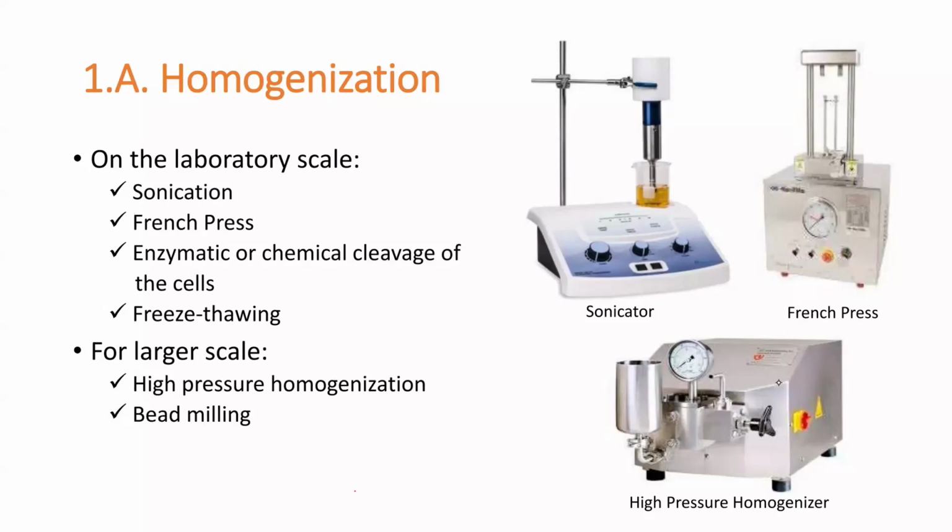Freezing and thawing is the same technique. All these techniques are just for you to have a general basis of how we do things, because I don't want to go into more depth on this.